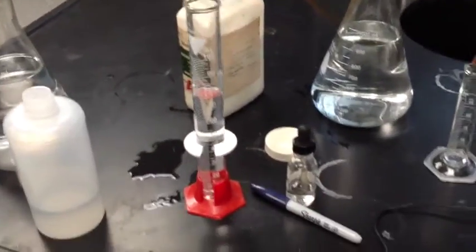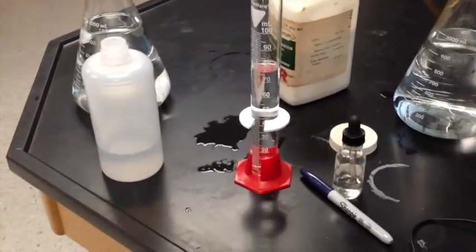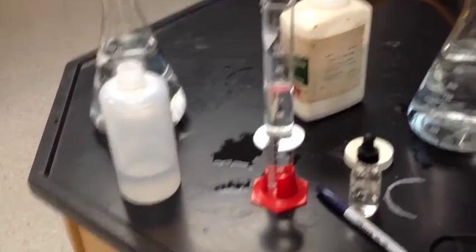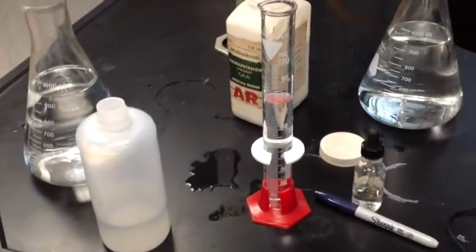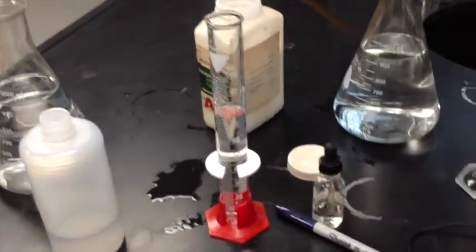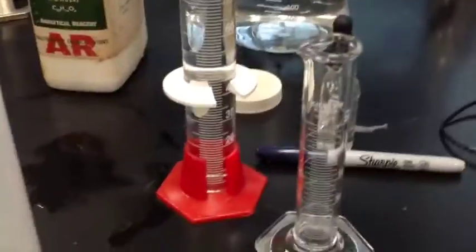But it's actually quite a common problem in chemistry. Let's say you make a solution, you want to figure out the pH at the end of it. This is the most accurate way of doing it. It's called titration. And so what we're going to do here is introduce you to how you do a titration properly. So let's take 15 milliliters. That's going to be our initial volume, 15 milliliters of this acid here.